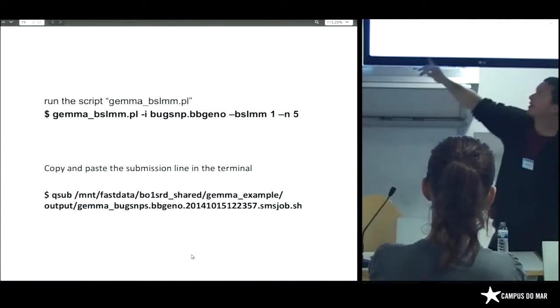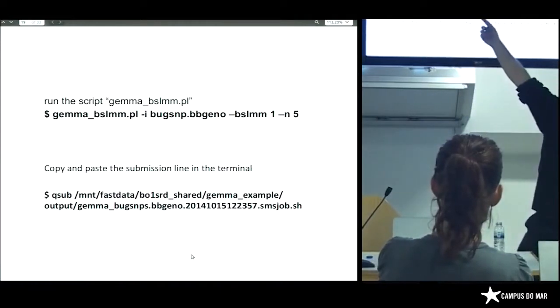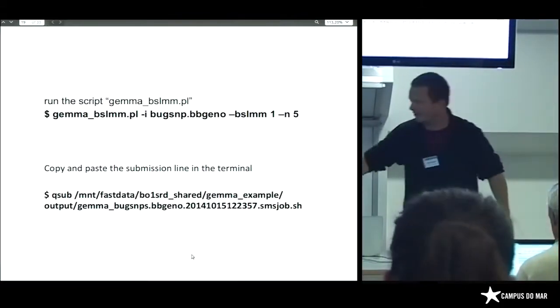So there's the command line. This is the abbreviated command line, so I don't have the fast data scripts, tools, stuff. So that's basically what we've just run, and we've set that running.